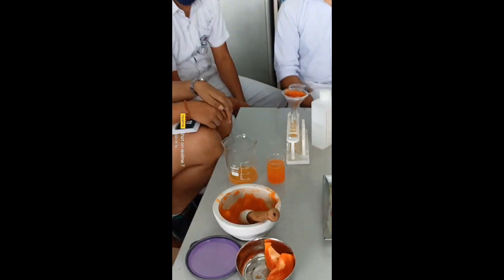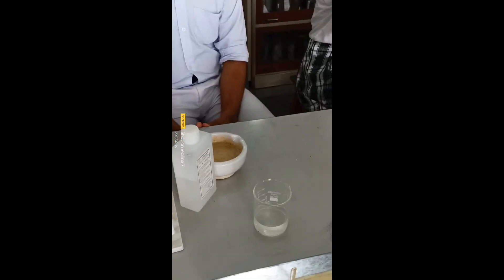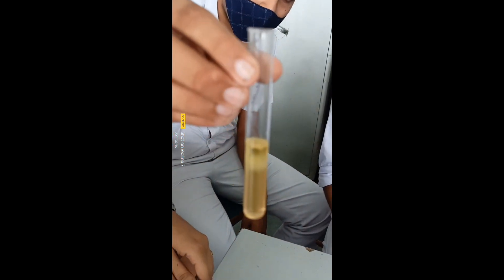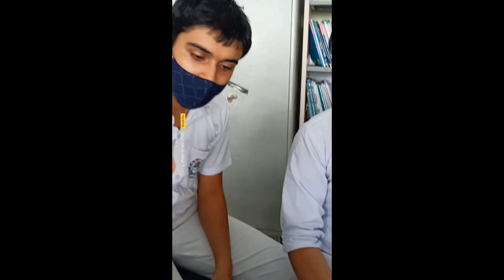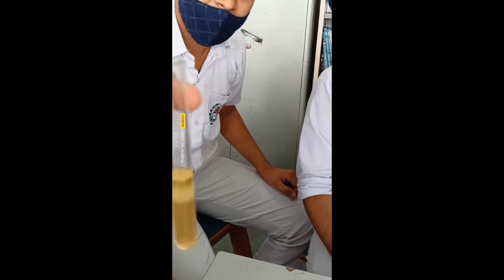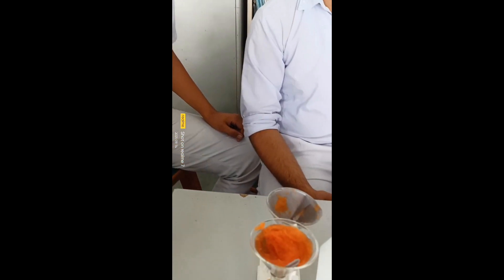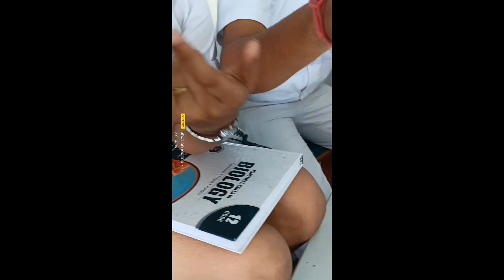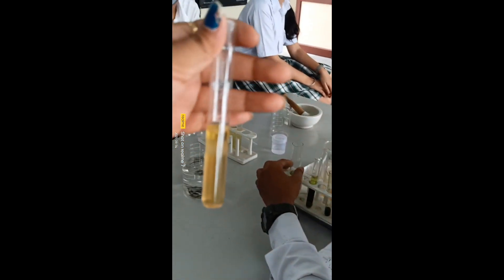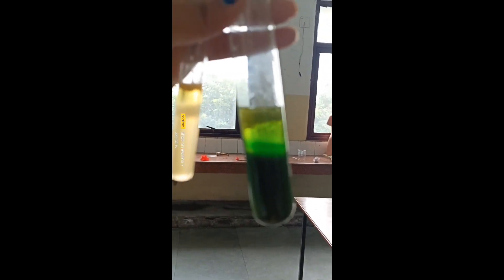The third group has isolated DNA from papaya. They followed all the procedure of DNA extraction. Here is their result — you can see this white precipitated structure in the upper layer. Comparing both samples, this is from papaya and this is from spinach — you can clearly see the DNA.